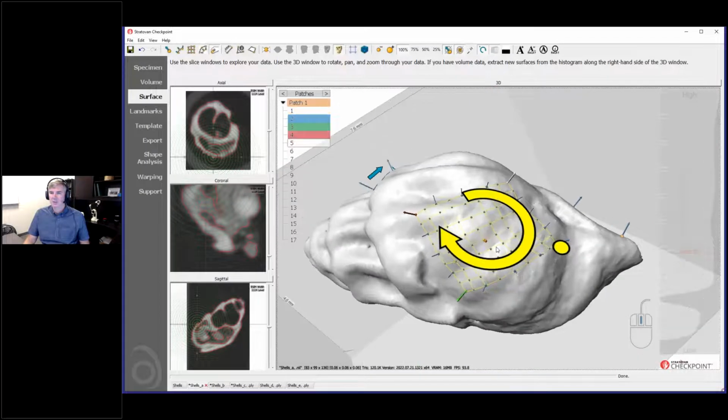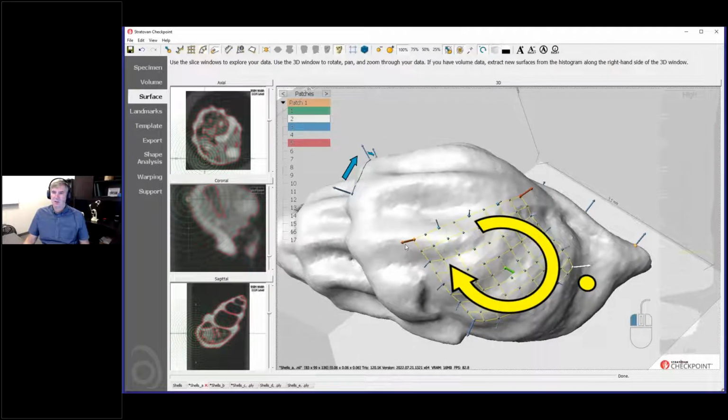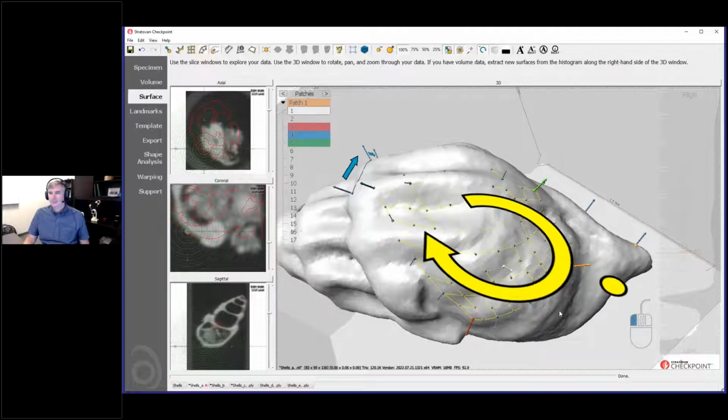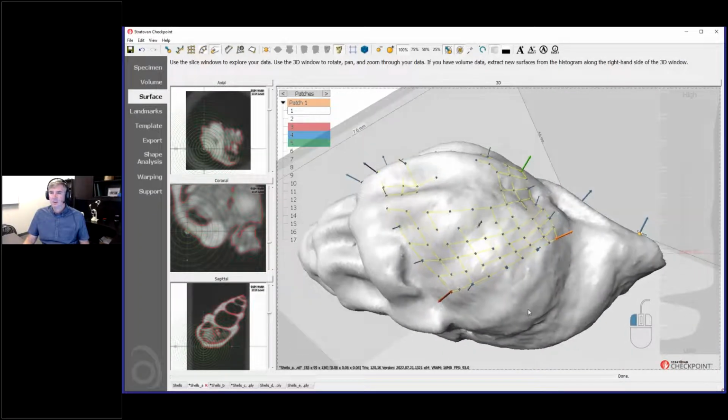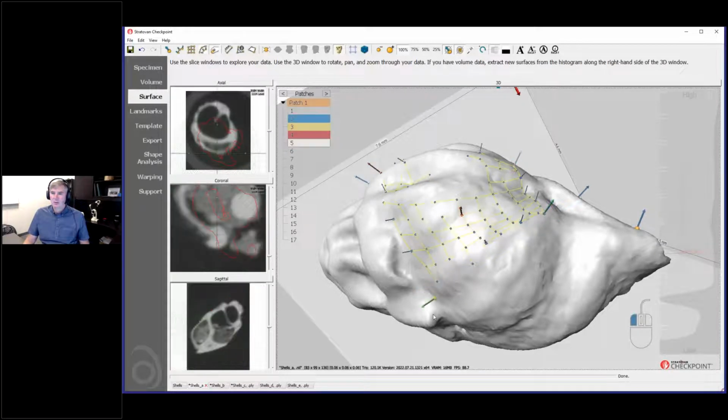this is a good way to cover a large area. So hopefully you have some anatomic feature. You know, let's say we might be able to move this up here, and let's say we want this edge to follow this curve here. Turn this thing off. And maybe this edge, so down here.